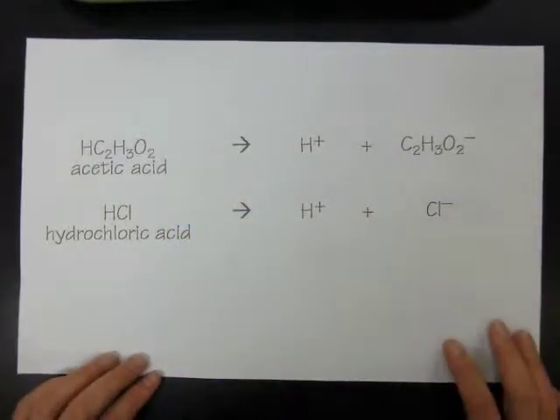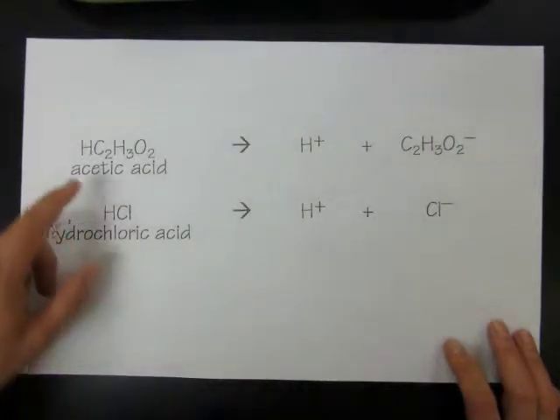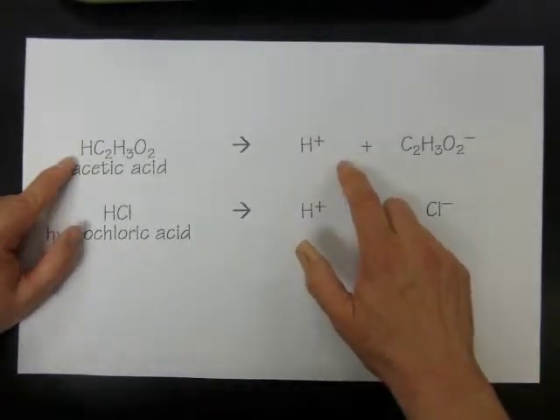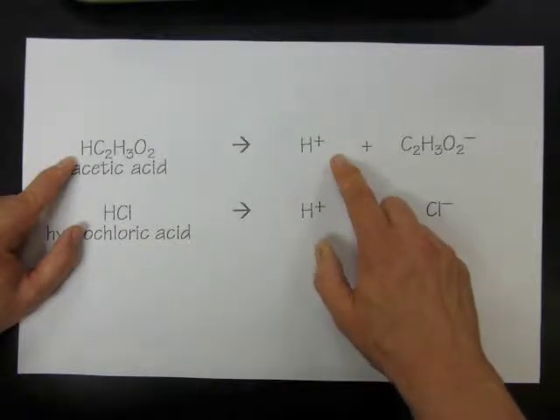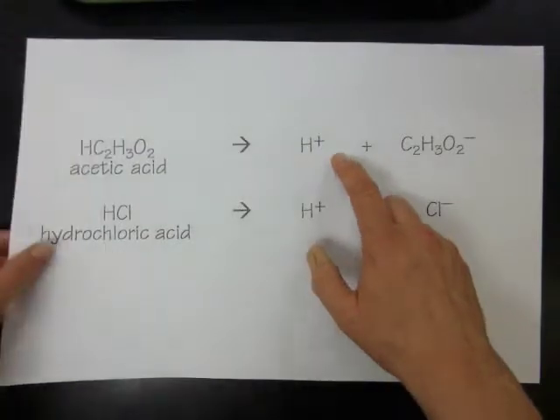So what we'll try to find out is if 100% of dissociation occurs for each of these two acids. The more an acid dissociates, the stronger it is, and the less it dissociates, the weaker it is. So we'll compare the concentration of acids before and after they are diluted to make the solutions less concentrated, and then we'll measure the pH to see whether the amount of hydrogen ion that we get compares equally to how much we started with.